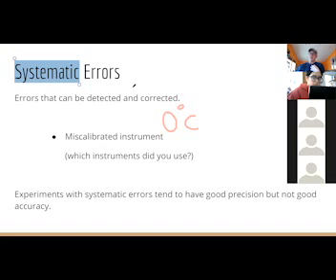And basically what I'm doing is, because an electronic thermometer doesn't know what temperature is. It's just measuring. It doesn't know what it's measuring. It doesn't know anything. It's just giving off a certain signal at a certain temperature. That's it. You have to tell the instrument that at that particular signal, that is 0 degrees, because it doesn't know how to do that. So basically I put it into ice water. It has a certain signal strength. And then I say, at that signal strength, that is 0 degrees.